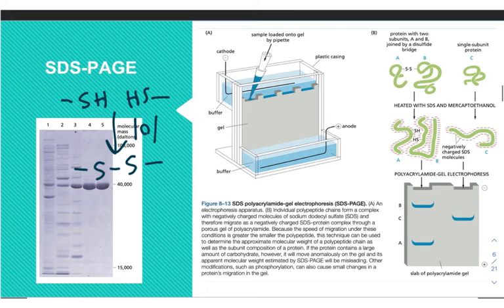In this situation, if you denature this protein of multiple subunits with SDS, it's going to stay in its polymeric form. It's not going to break into monomers because you don't break covalent bonds. This is where reducing and non-reducing conditions come in. So if you have a reducing protein electrophoresis, that means that you break disulfide bridges. If you have a non-reducing protein electrophoresis, you are not breaking disulfide bridges. So those are the things to keep an eye out for.